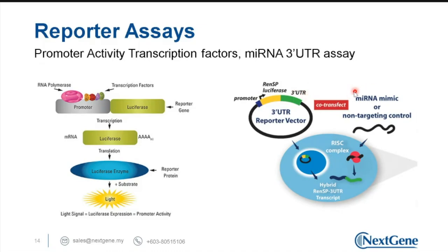We try to see whether the microRNA is binding to our mRNA of interest, and if this happens, most likely it is going to degrade this particular mRNA. So therefore, we are studying the interaction between microRNA and the 3' end part of messenger RNA. Okay, the promoter is not modified in this particular experiment, different from the earlier one. Okay, so we are modifying the 3' untranslated region.